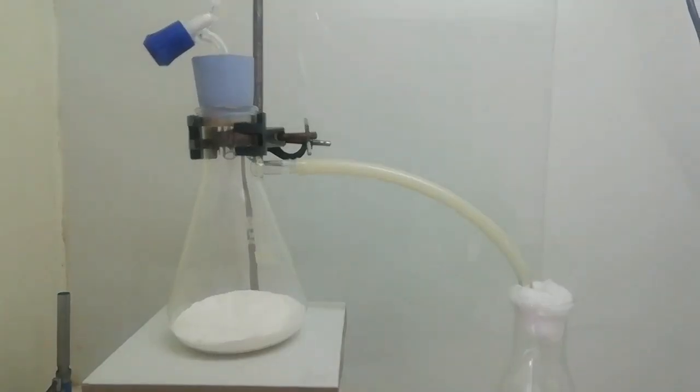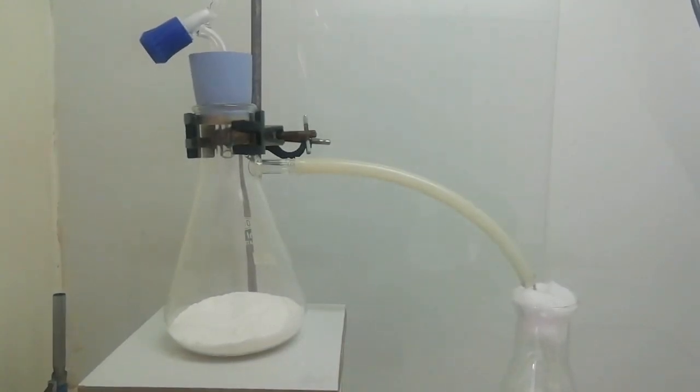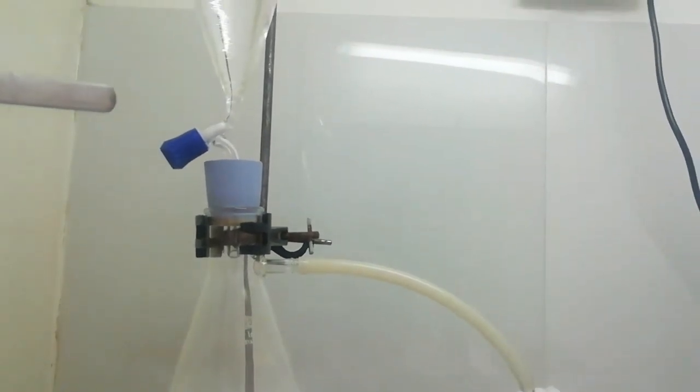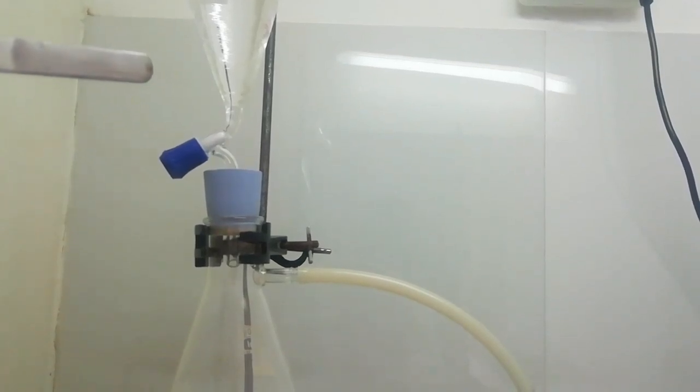So here is the setup. In this filter flask I have 40 grams of sodium metabisulfite, and in this separation funnel I have dilute hydrochloric acid.